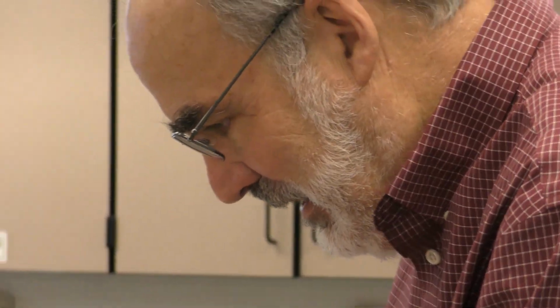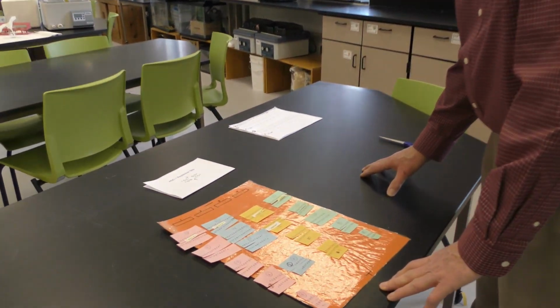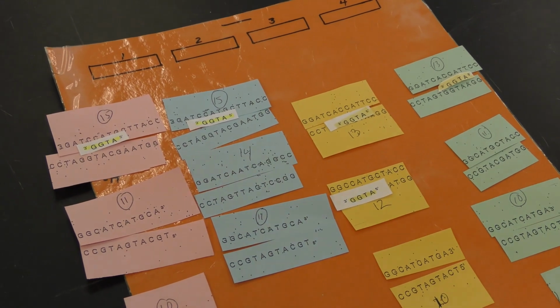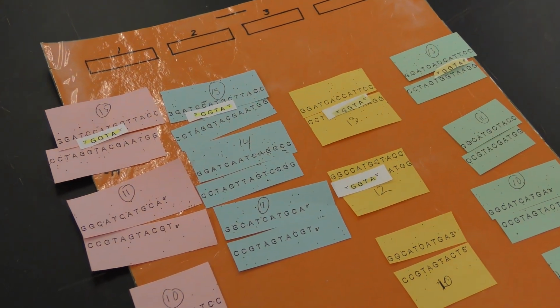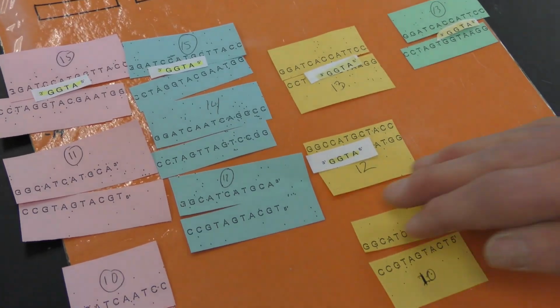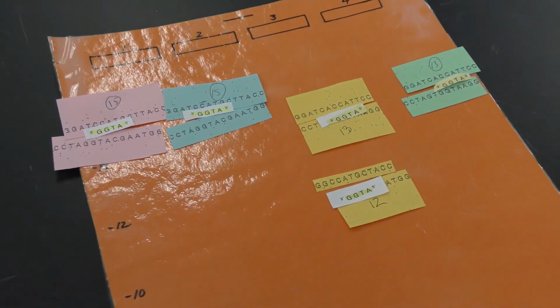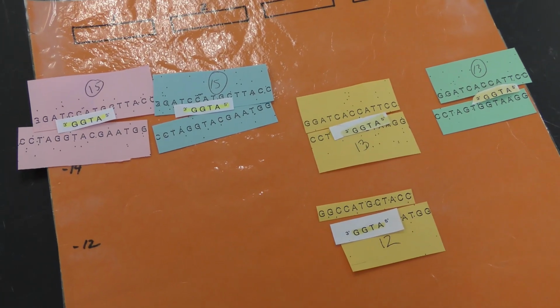Okay, so we went ahead and I labeled all the fragments, and this is where the probe is going to hybridize, okay? So at the end of the experiment, when we visualize this, the only fragments you're going to be able to see are the ones where the probe hybridized. So basically at the end of a Southern blot, you would only see these fragments, okay?